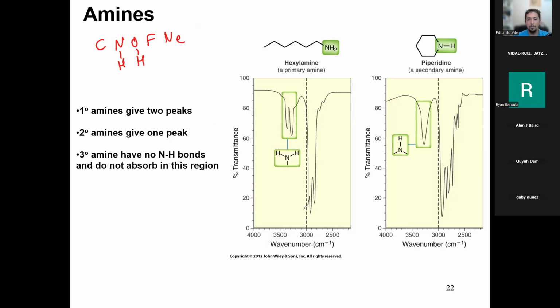So again, what are these right here? I'm going to use the color green. What are these? They're at around 3000, 2900. What are these spikes? What is this whole thing? It's everywhere, right? You need to know.